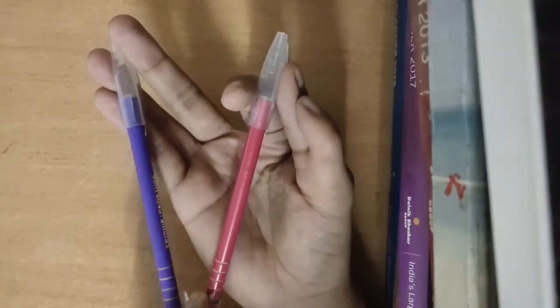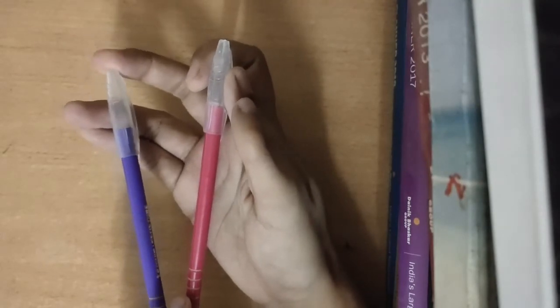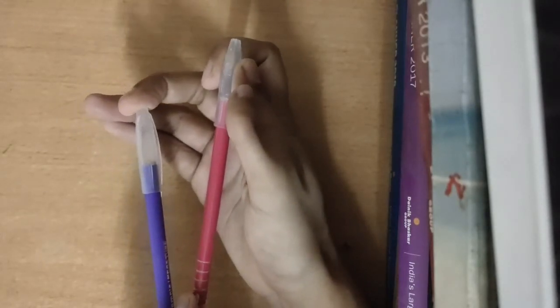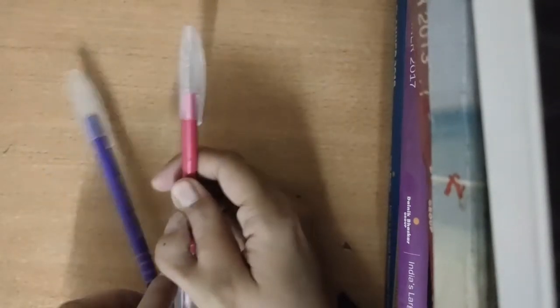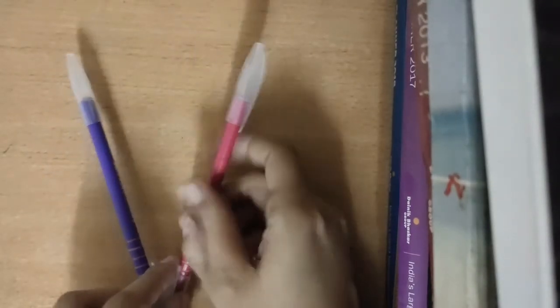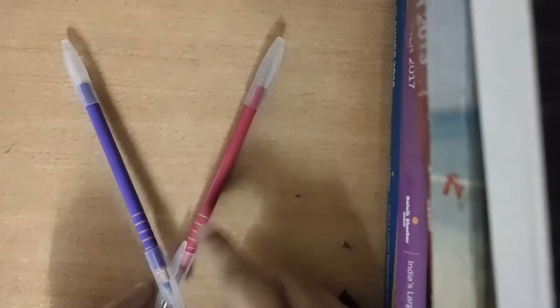In asymmetric stretching, the direction of motion would be different for different bonds. Here you can see that in stretching vibrations, the bond angle remains the same, but bond length varies.